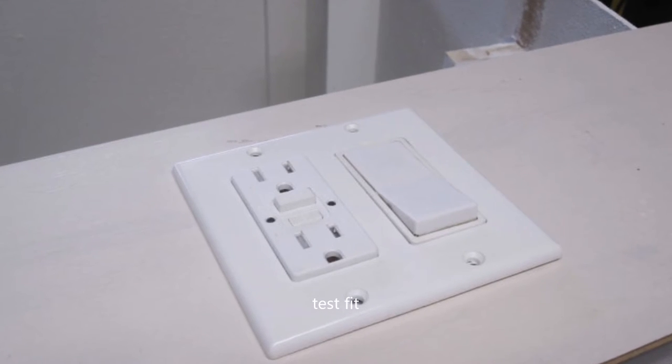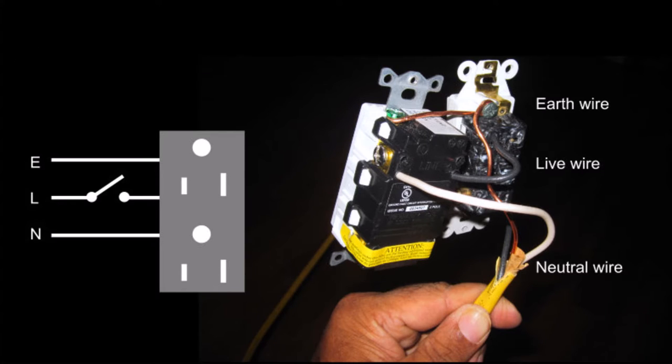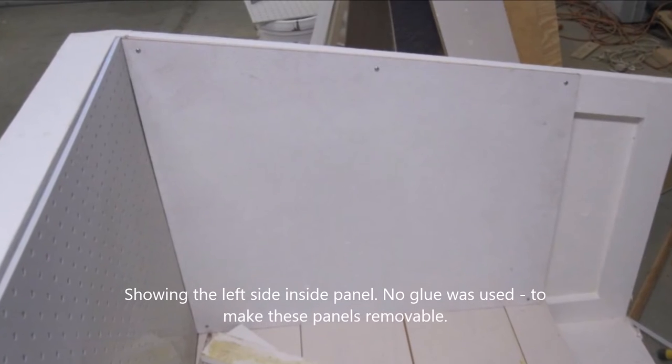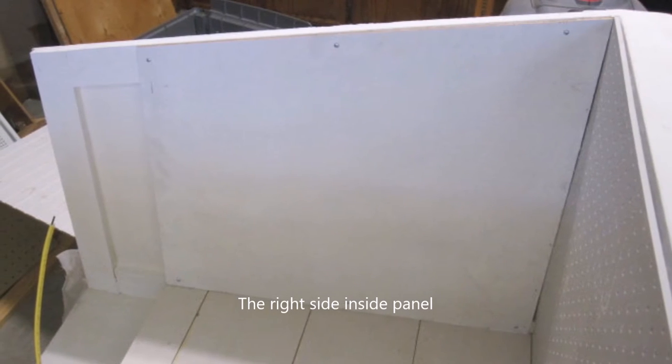Once the test fit was okay, I started the wiring, which was quite simple. The live wire goes through the switch into the socket; earth and neutral are connected to the relevant screws or holes depending on your unit — white is neutral here. I put in an extra yellow wire as well. The side panels were attached with just screws, not glue, because I might need to remove them for cleanups.